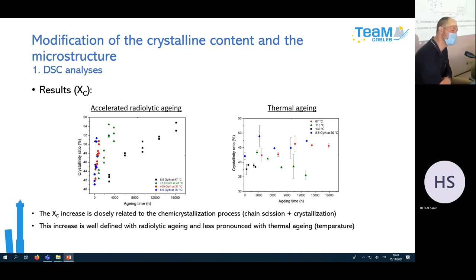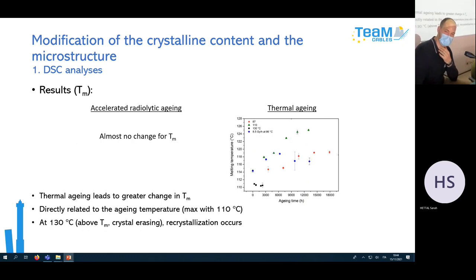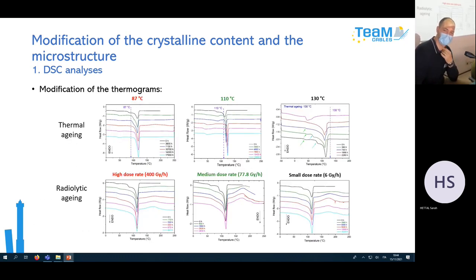Sébastien, I have a question related to the DSC measurements at 130 degrees. If you can go to the slide where you... I can really understand the fact that you have very different curves among the aging levels, and I agree. But concerning a particular sample, I guess that you have performed these measurements over three or four different points. The question is, is the curve that you obtain for a particular zone of the sample the same among the different zones of the samples?